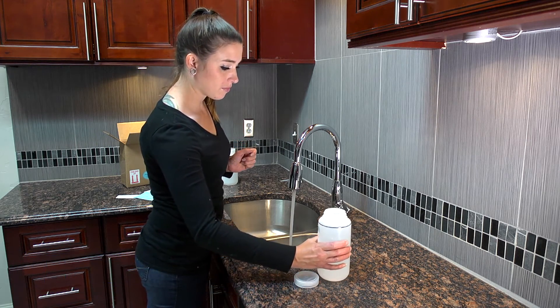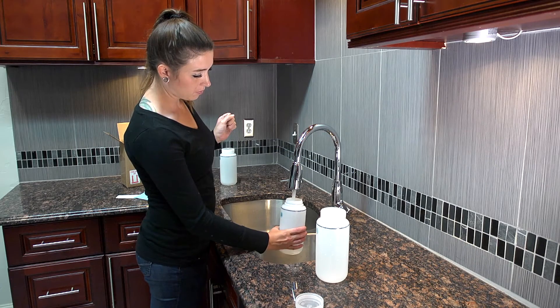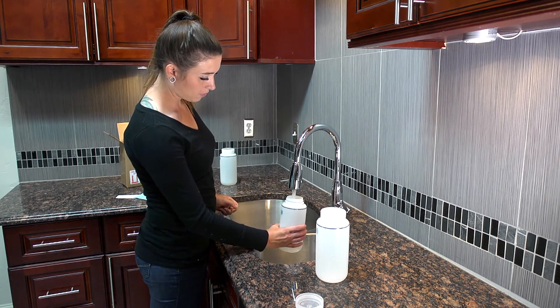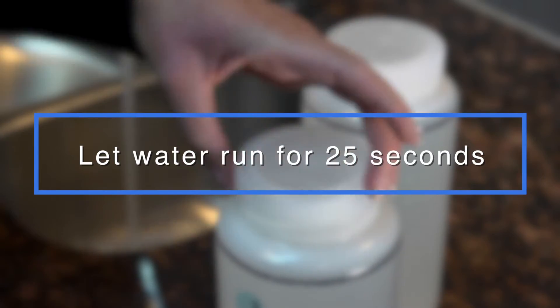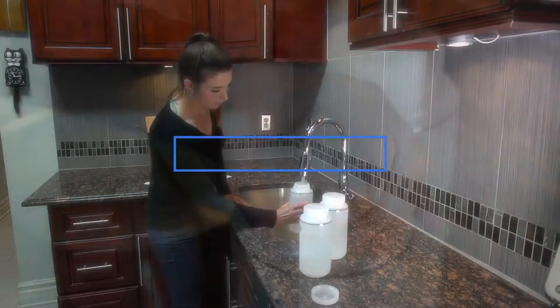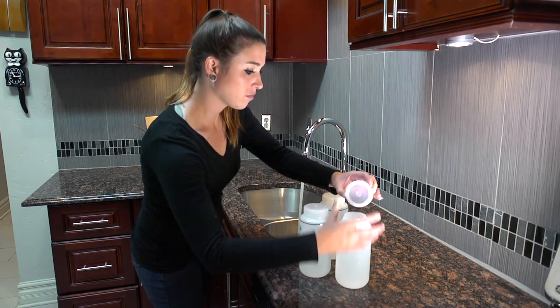Once filled, remove the bottle and let the water continue to flow another 25 seconds. Use bottle number two to collect the second sample following the same steps. Once that bottle is filled, let the water run 25 seconds again before you fill the final bottle. It's important to let the water run until all three samples are collected.